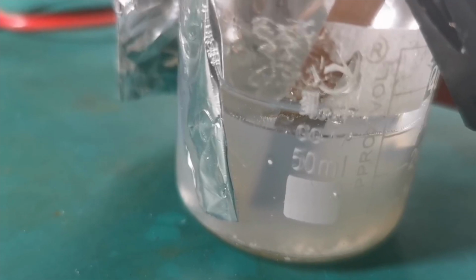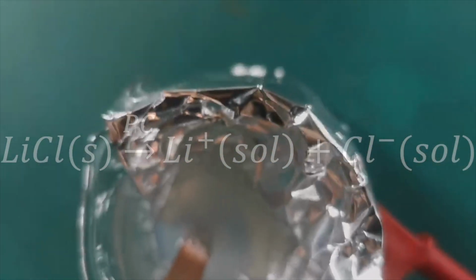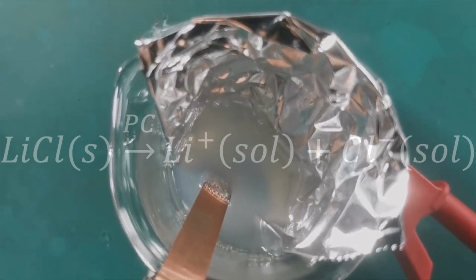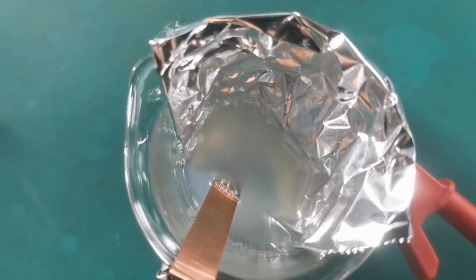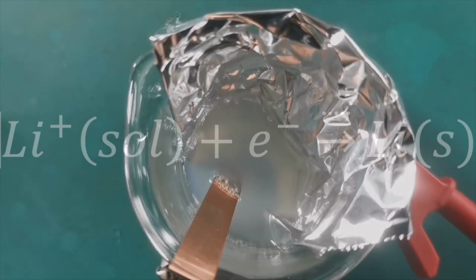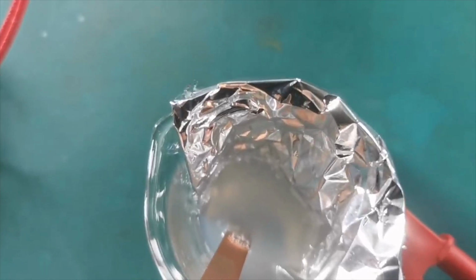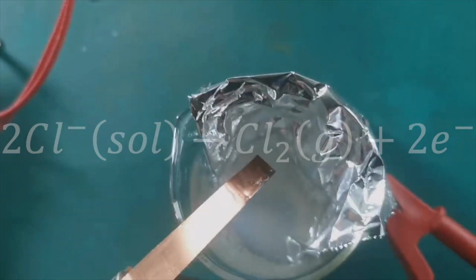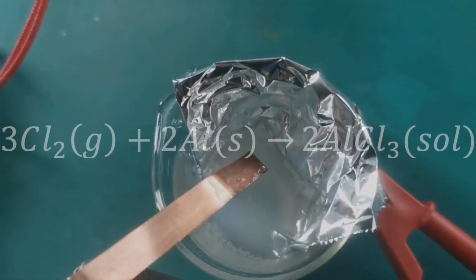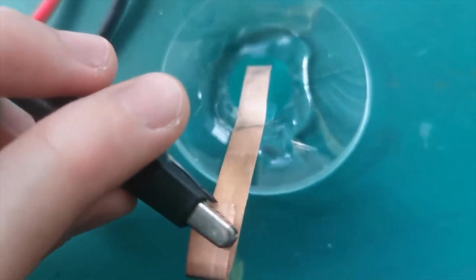Anyways, what is happening here? The lithium chloride first dissolves into the PC and dissociates, forming lithium ions and chloride ions, just as it does in water. Because there are very few hydrogen ions in the PC solution, the lithium ions can gain electrons and plate out on the cathode as a thin layer of lithium metal, which is the tarnish you see on the copper. The anode is generating chlorine, which immediately reacts with the aluminum to generate aluminum chloride, so only a few bubbles can be seen. After a few minutes, I took the copper cathode out and immersed it in some water.